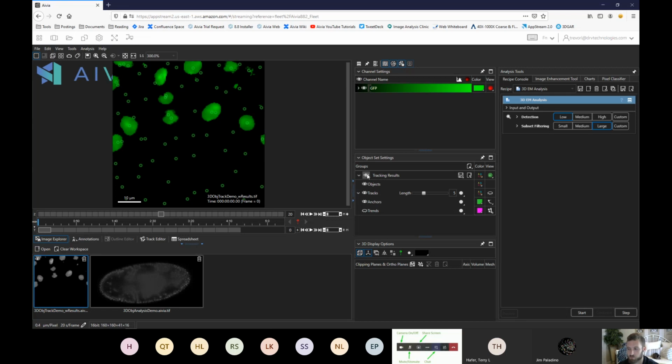So this is another way it's useful, especially in a lab where if you have a lot of workstations but only one Aivia license, you can have Aivia Community on all your workstations, generate results, and then get the person off the main workstation to go look at their results elsewhere and open the workstation back up for other people to make results.